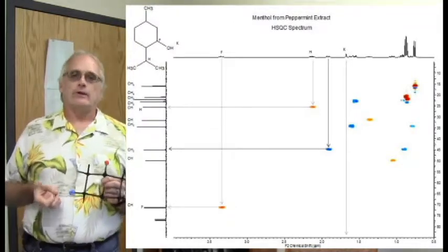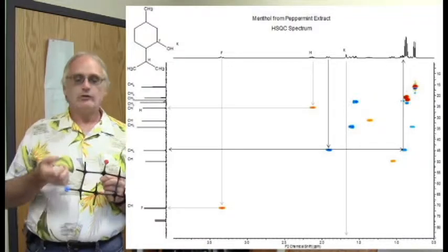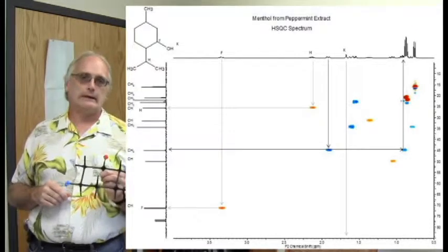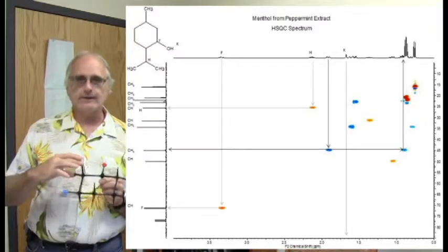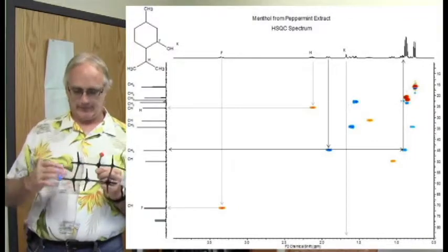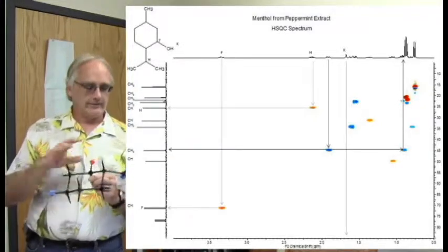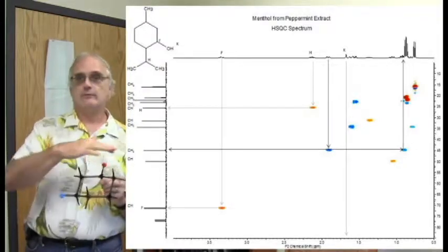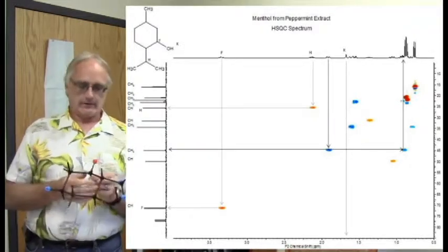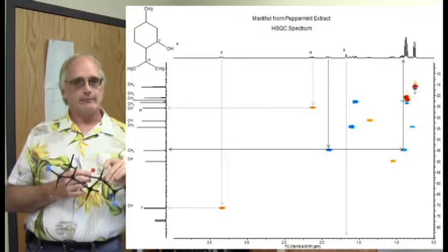And this is where the HSQC really shines as well, because you'll notice that the carbon actually has 2 proton correspondences, the one at 1.95 and one much farther upfield, about 0.9. It's these 2 protons, and they are very different from each other. They are 1 ppm different, 400 hertz different. This is a chiral molecule. This thing is not flexing. These 2 protons are quite different. We see the differences in the 2 methyls over here. We're going to see them in all the CH2 groups. But we've nailed down position D very nicely. And thus, we also now, by the process of elimination, know position G right here. We know that proton.